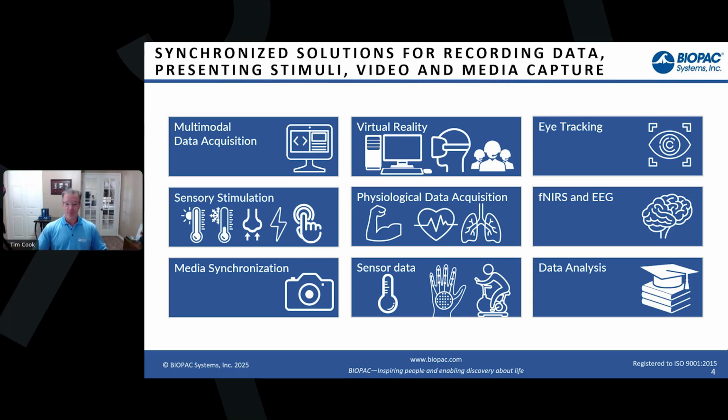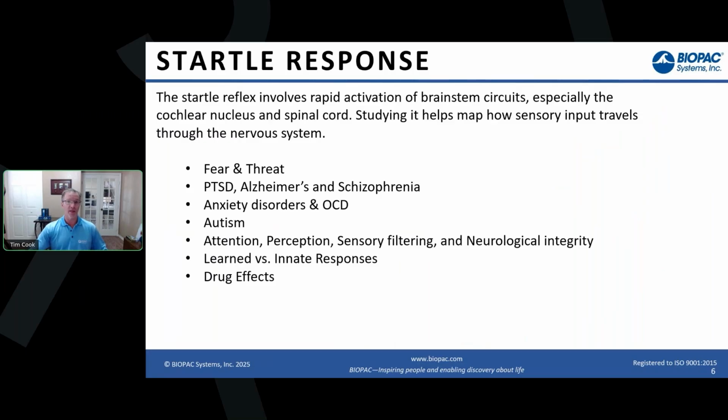For today, we are going to focus on Startle and Prepulse Inhibition, and show you how to build out those files and to run the data related to that.